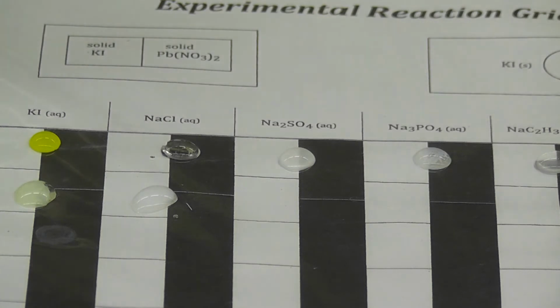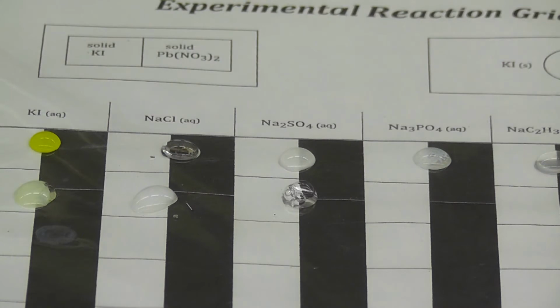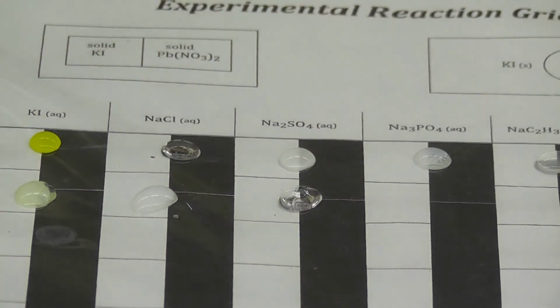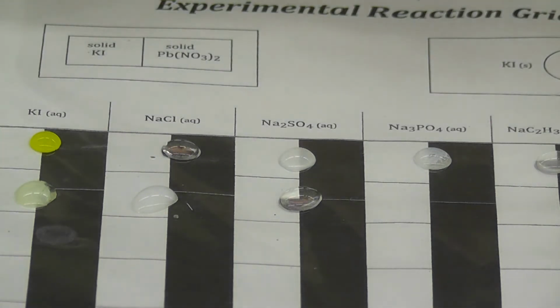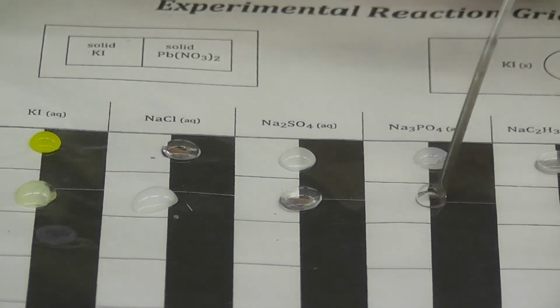Okay. So 1 drop of silver nitrate. Goodness sakes. With the sodium sulfate. 1 drop. Okay, so observe your reaction there. Another drop of silver nitrate. Okay.